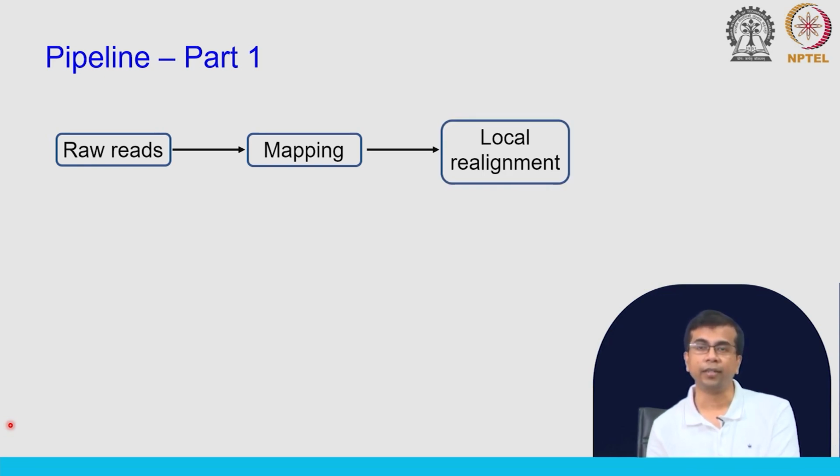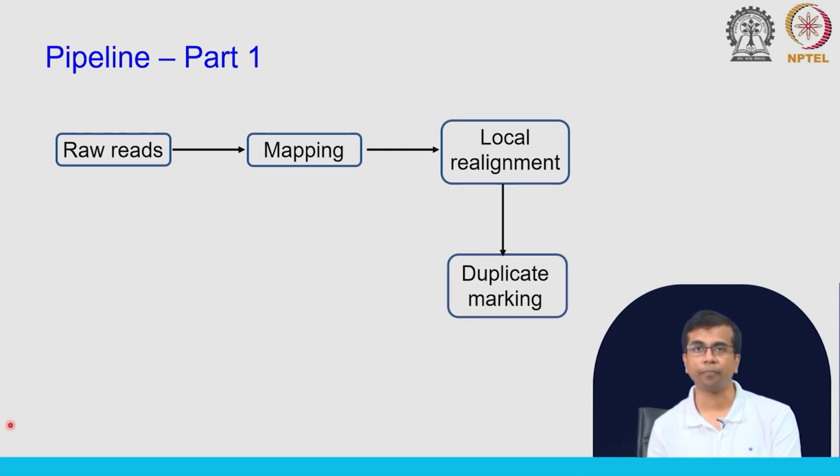This is again very important, as we have just discussed: because of certain regions where you have indels present, or regions that are low complexity regions, unless you do local realignment using other tools, you will have false variant calls, and we want to minimize that. So, we will do something called local realignment. You will see in the hands-on that we will actually do the realignment.